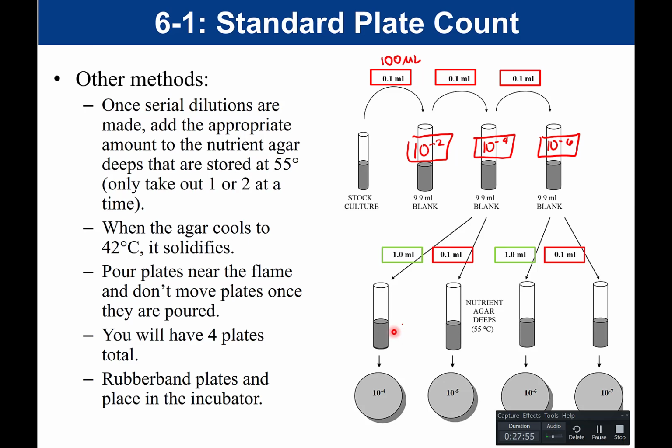And it's also going to end up with agar on the lid instead of just in the bottom of the plate, and your count is not going to be accurate. So you want to make sure that when you pour these, you pour them close to the flame and in a place where you're not going to be worried about having to move them after.